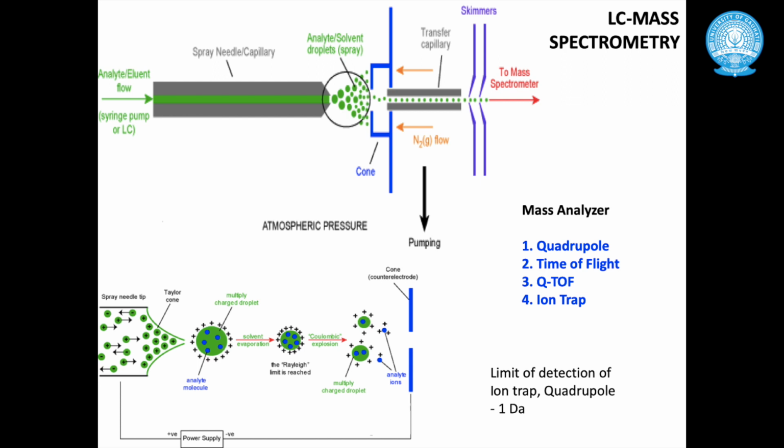Here the importance of the figures after the decimal point depends upon the instrument which is used. There are now HRMS instruments available, which is high resolution mass spectrometry, where the digits after the decimal point are very accurately determined, to at least 2 places after the decimal.